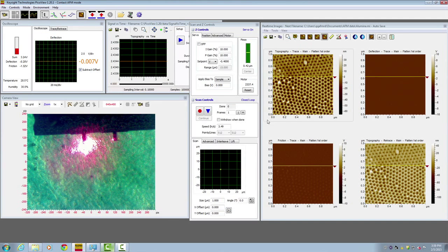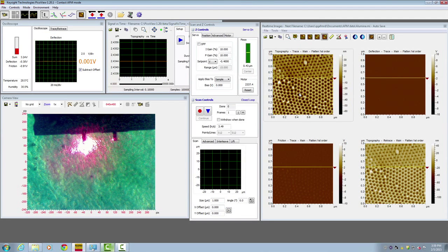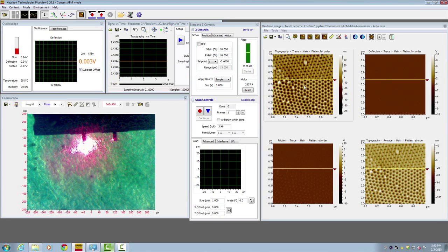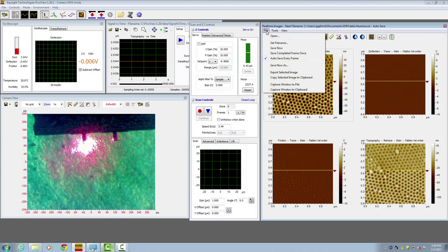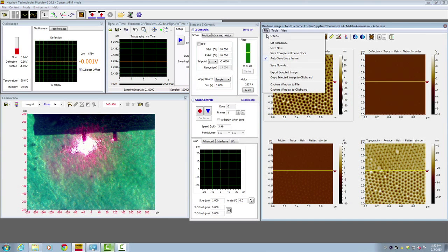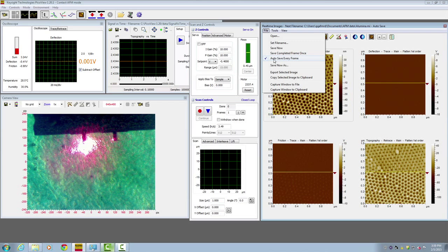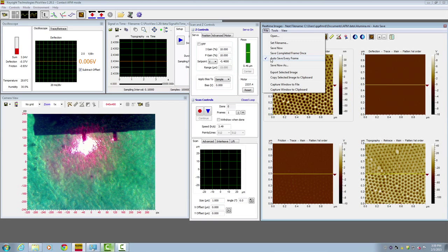Remember, when you click save, the image is not saved yet until it finishes one full frame of scan. Also choose auto save every frame, and therefore every time the scan finishes, the image is saved under the set file name.